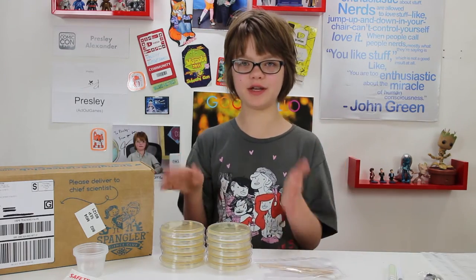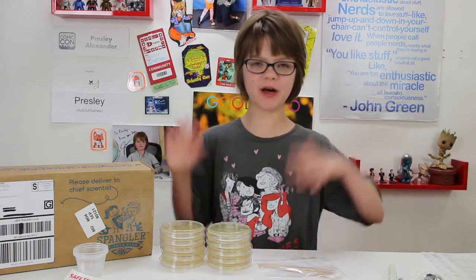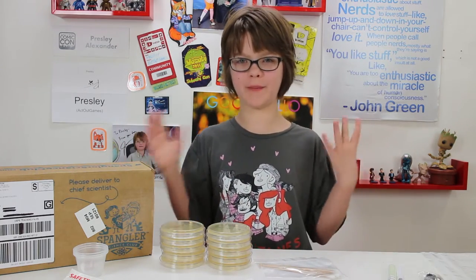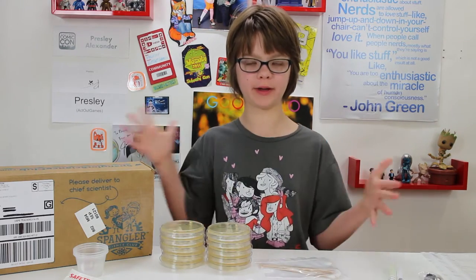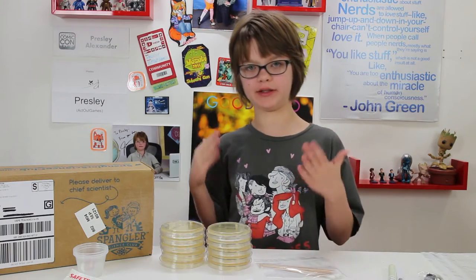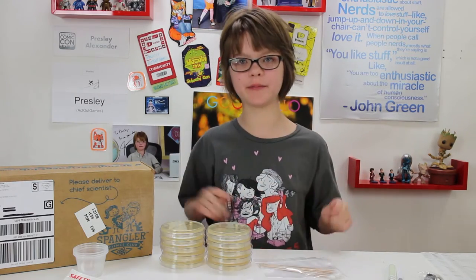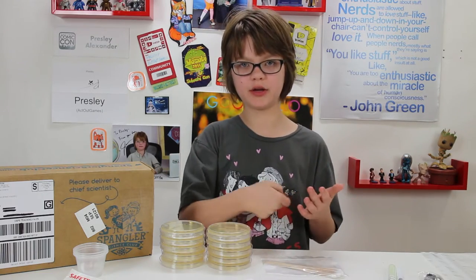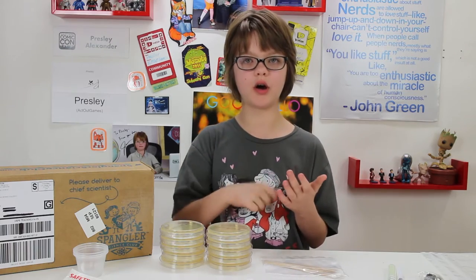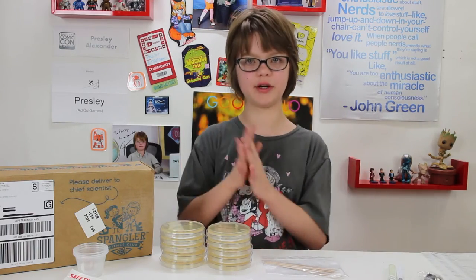The kit comes with ten petri dishes that have agar in them. Agar is basically just a word for bacteria food, and bacteria really loves it, so they grow really quickly — like within 24 hours you'll have a really good sample. That's what's in the bottom of the dishes and why they look kind of yellowy. They also come with little swabs so you can take your samples, and there are great instructions on how to properly take the samples, which I wouldn't have thought of on my own.